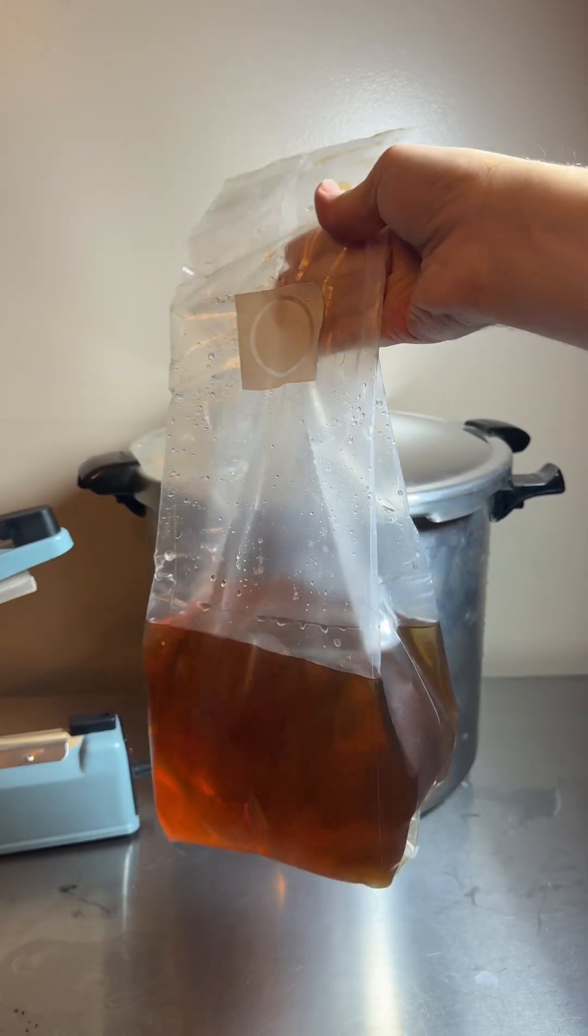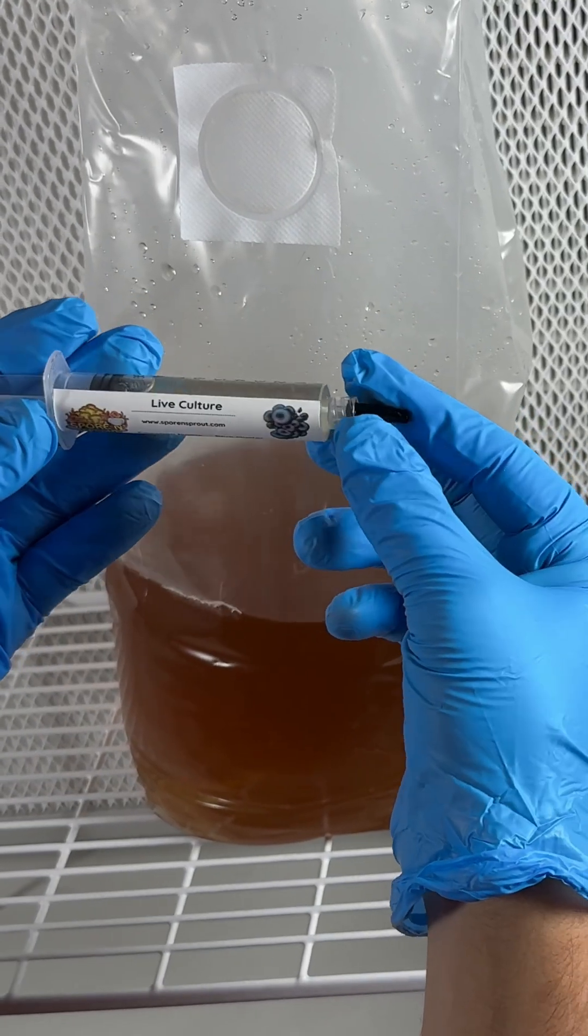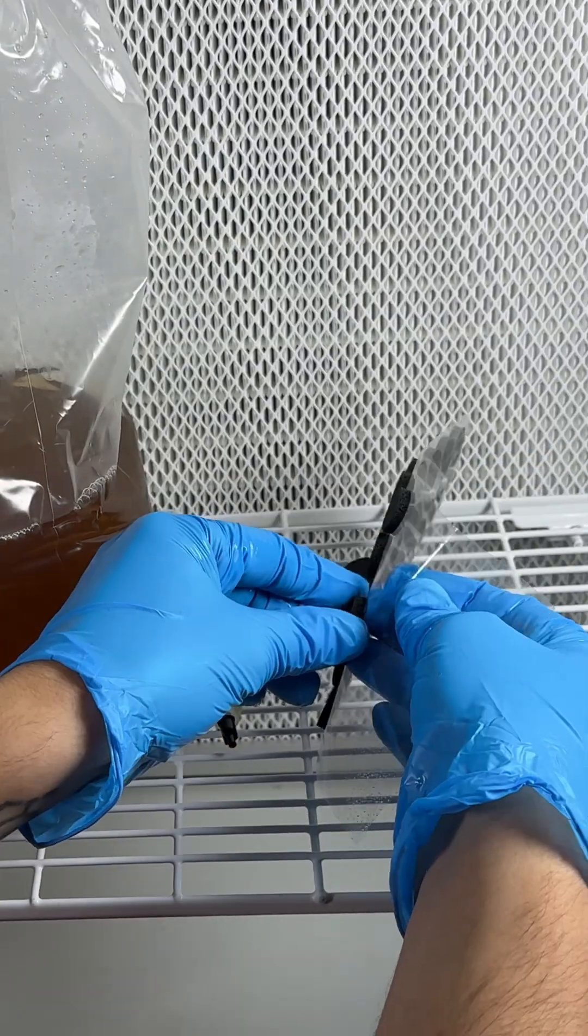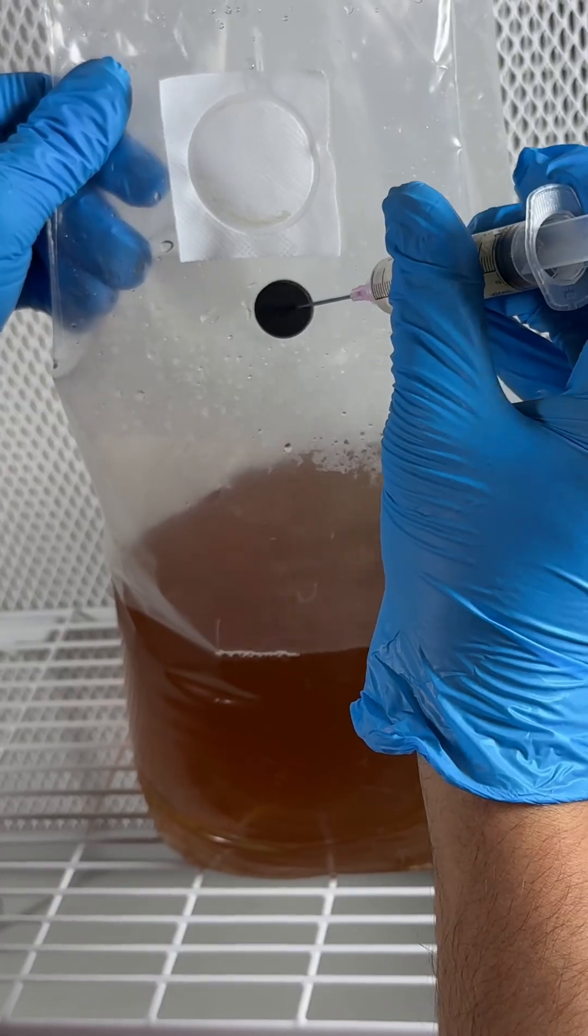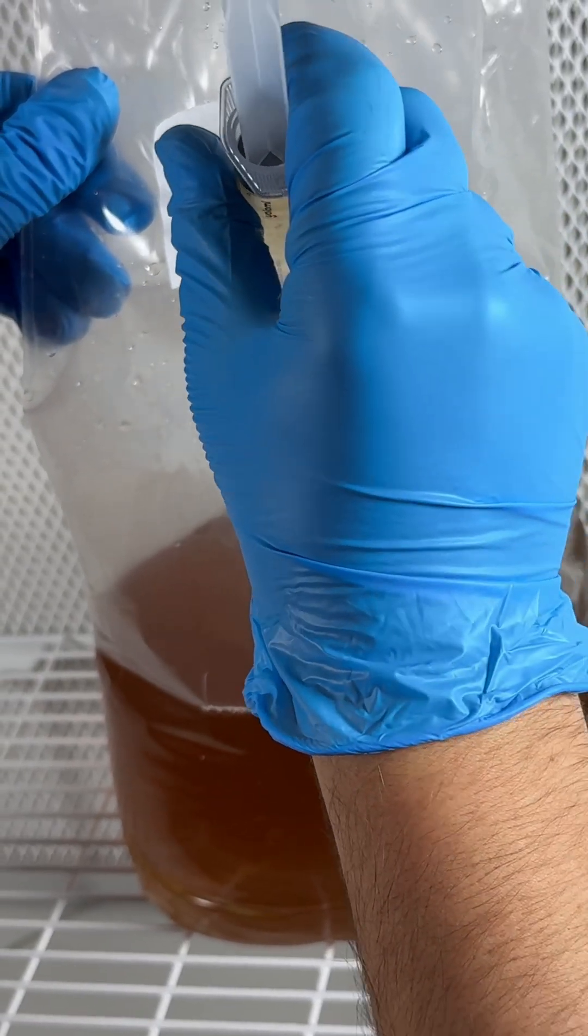Now that the bag is sterilized and sealed, I inoculate it with mushroom liquid culture. I just use one of these injection ports and stick it anywhere on the bag, and then I inject through it with a sterile needle and empty the syringe of liquid culture.